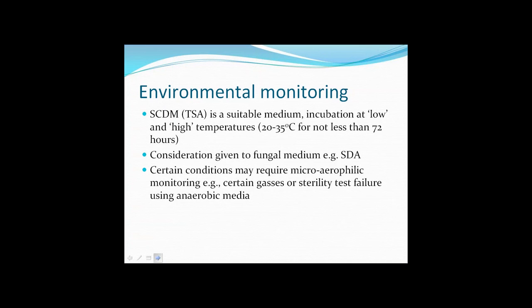The USP also addresses the subject of anaerobic or microaerophilic microorganisms, and it states that in certain circumstances, such as where a process is using nitrogen gas lines, or perhaps following a sterility test failure where the fluid thioglycolate medium has detected contamination, then it's quite useful to consider the adoption of an anaerobic or microaerophilic monitoring regime.